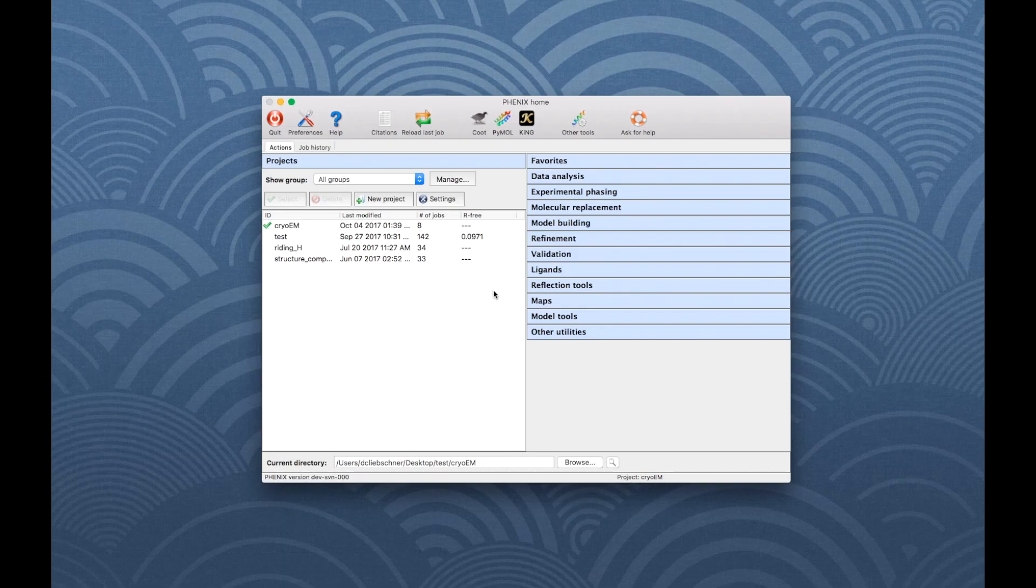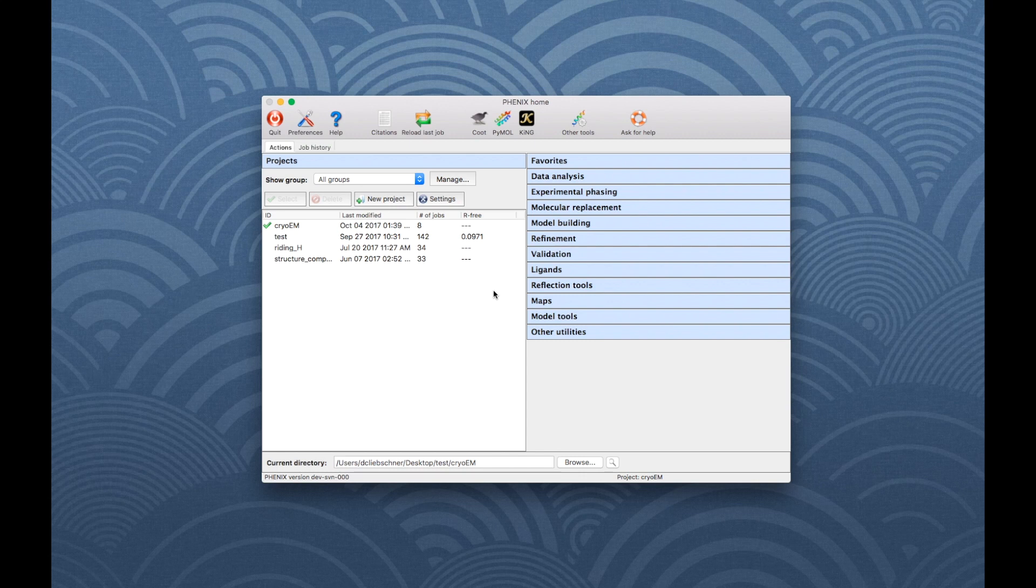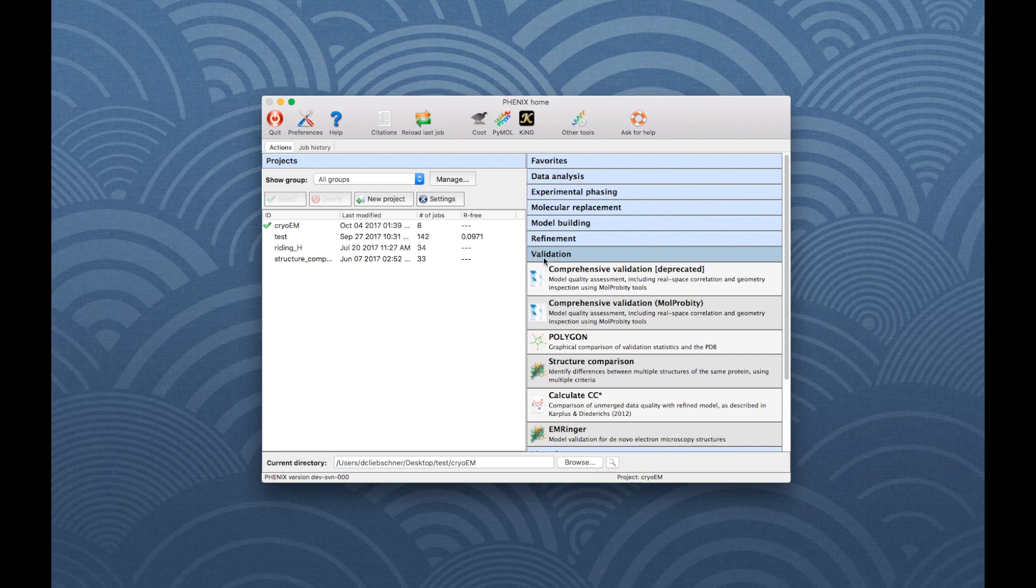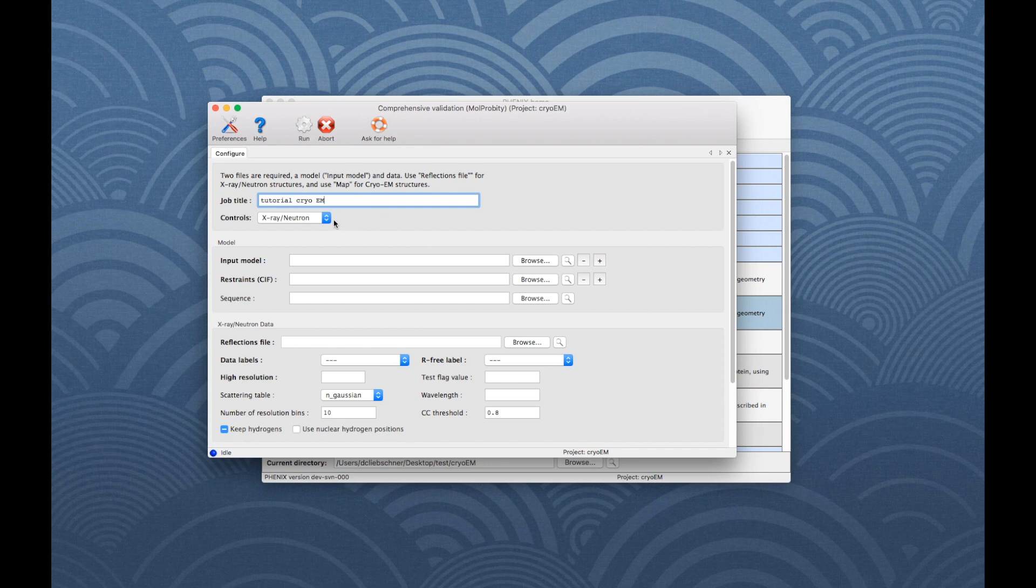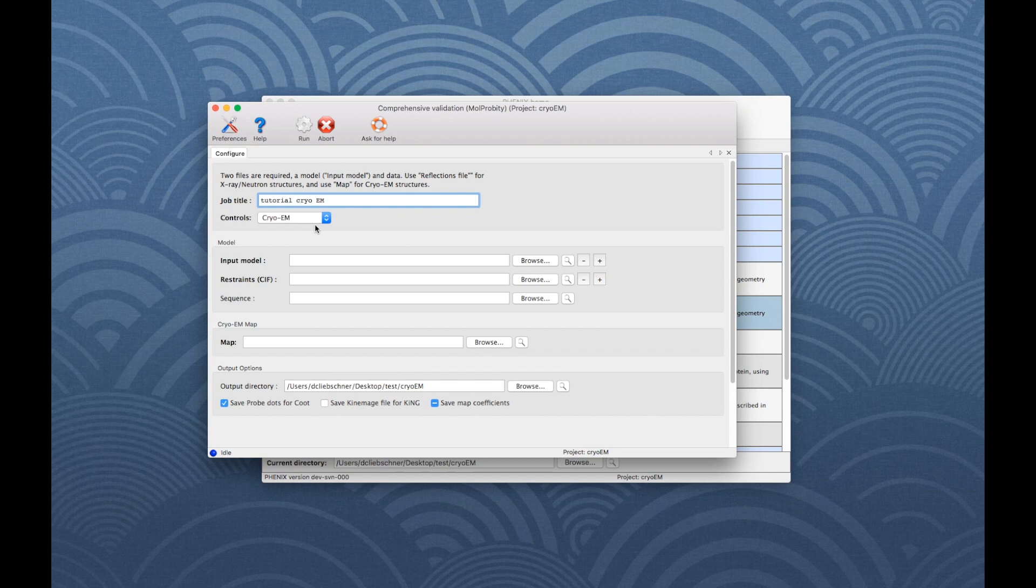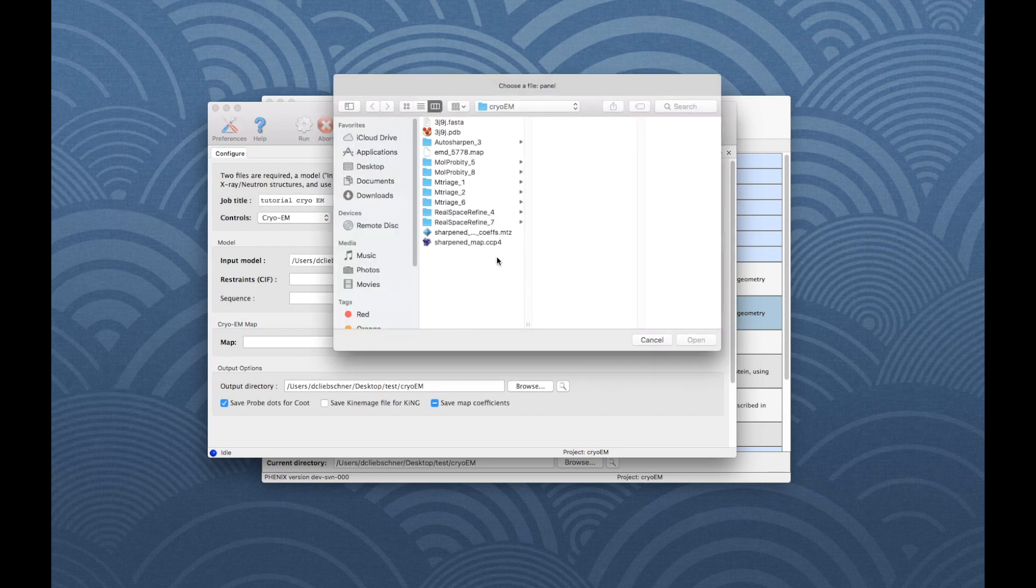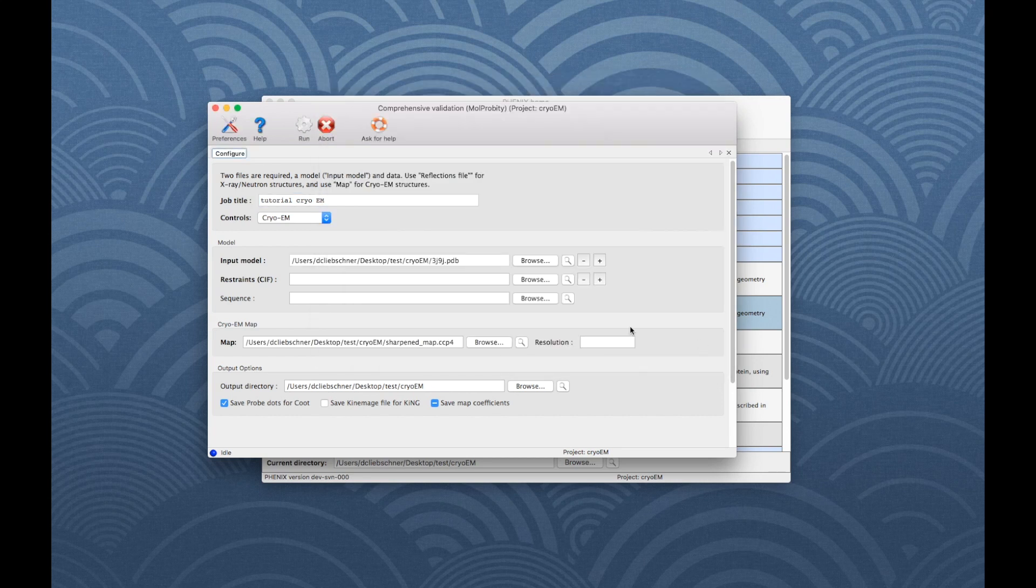The MolProbity analysis can be performed separately from Refinement as well. To do this, go to the Phoenix main window and choose Validation, then click on Comprehensive Validation. By default, the program is set to be used with X-ray Diffraction data, so make sure to change the controls to Cryo EM. Required input files are a model file, a map file and the resolution.